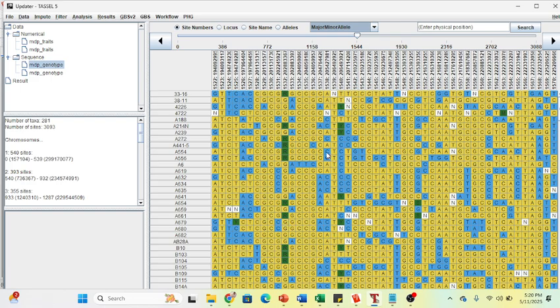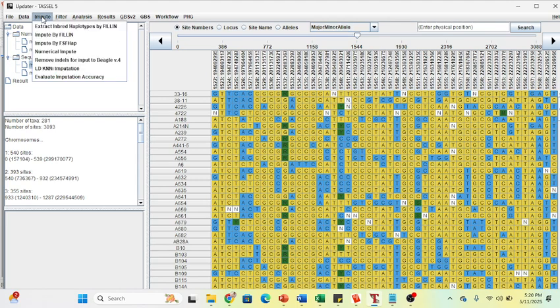Now what you have to do, we'll just see an overview. First, if your data has missing values of more than 50, 60, or 70%, then you have to go for imputation to fill those missing values. We'll run an algorithm. I'll explain in detail in later classes how we should impute. You can impute from this option, and this will fill your missing values.